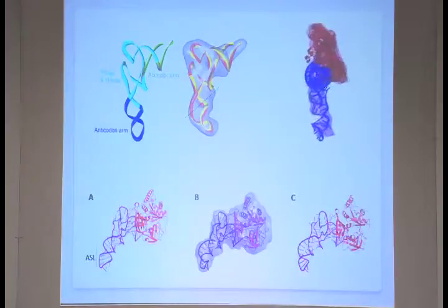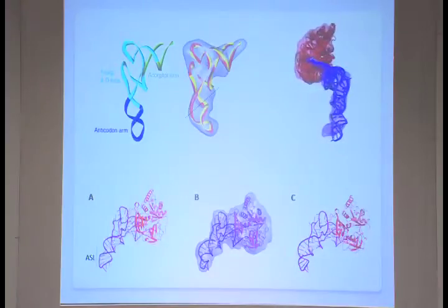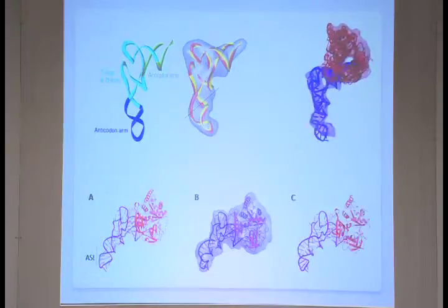So after the anticodon region, when it was fitted, a clear kink was seen. So then it was confirmed one way from the cryo-EM.